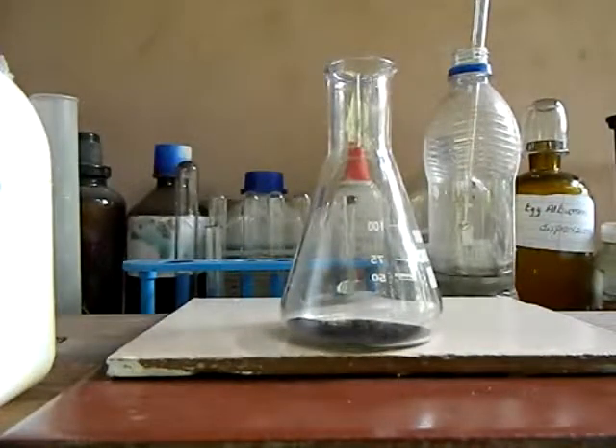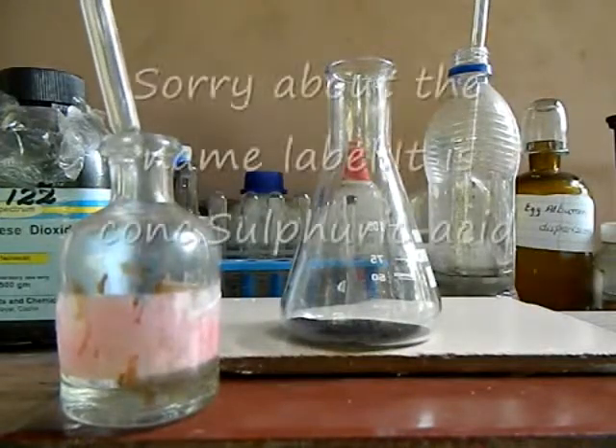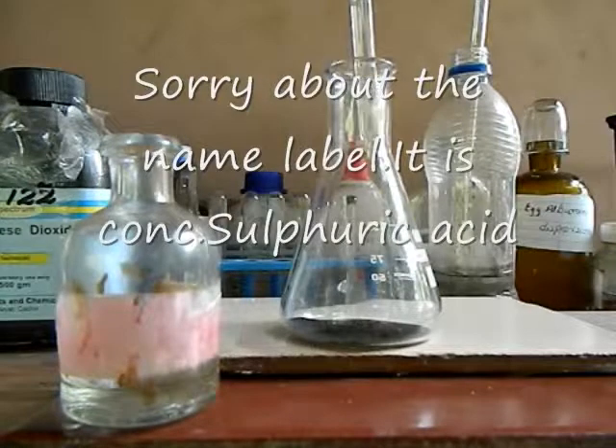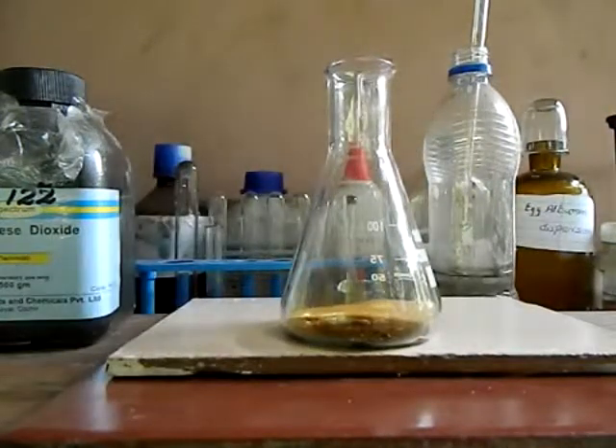It turns to a black mass. Now, with the help of a dropper, add concentrated sulfuric acid. Within a few seconds you can see the evolution of brown fumes. It is elemental bromine.